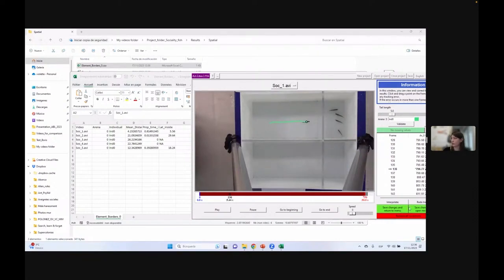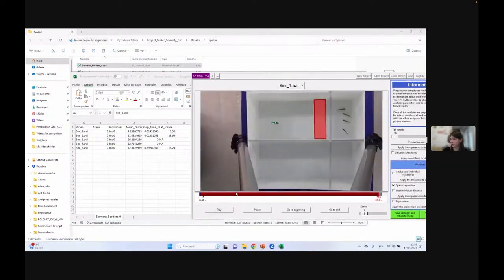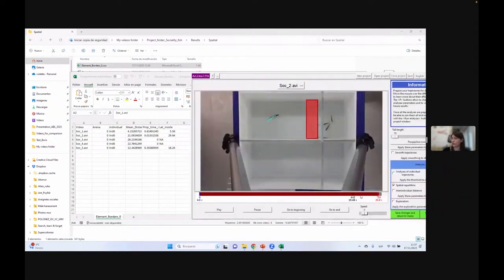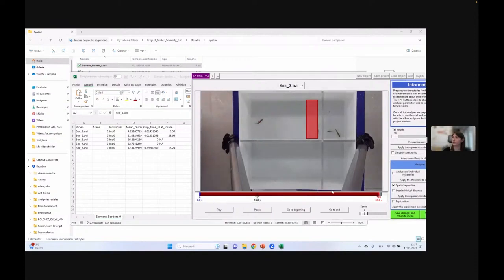So we see that we are quite good. In fact, we can even do it like this, so 5.56, as you can see, this is correct. I won't do it for all of them, but the second one arrived very late, and the next one didn't even enter the area of interest, and it's indeed the case.